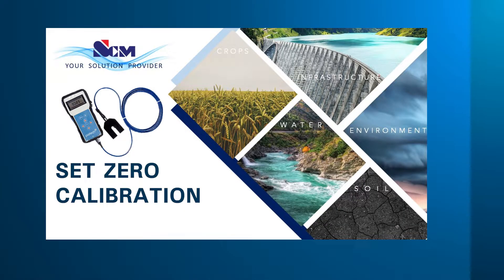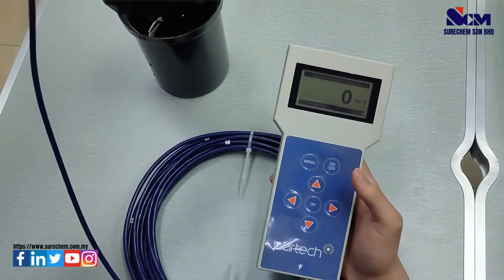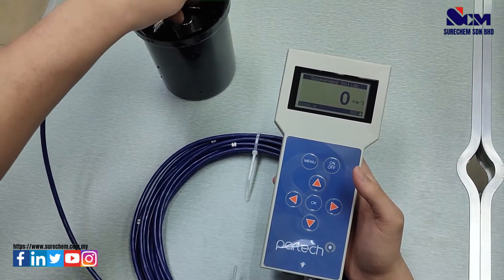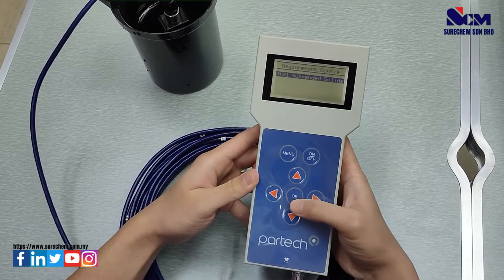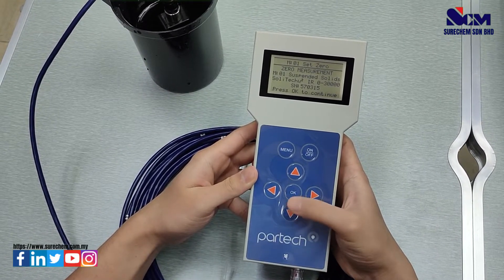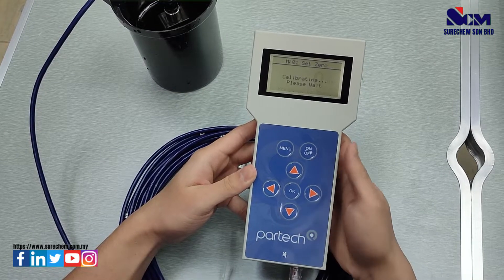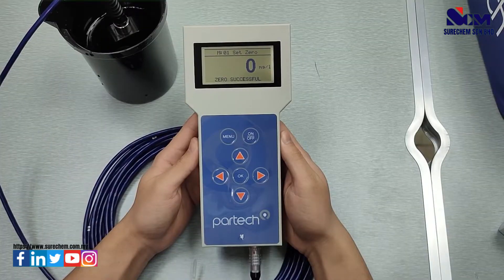How to set zero calibration for Total Suspended Solids measurement: first put the sensor into distilled water. Go to the menu, go to Measurement Configuration, select Set Zero, press OK, and press OK again to set zero. Wait for a while and it will show success.